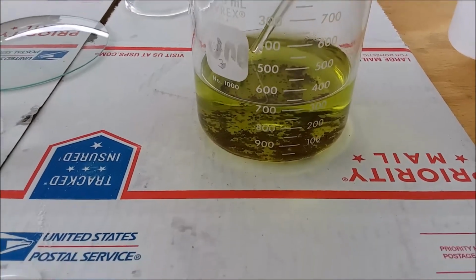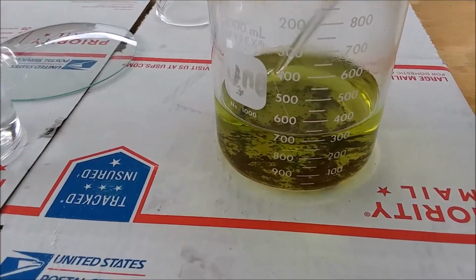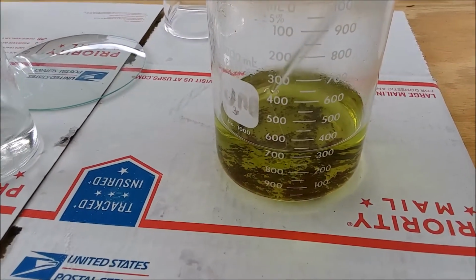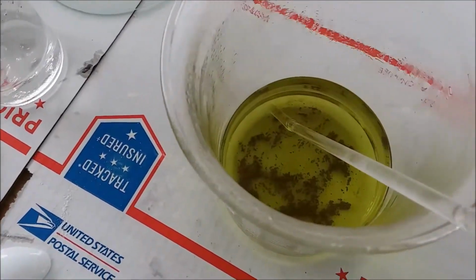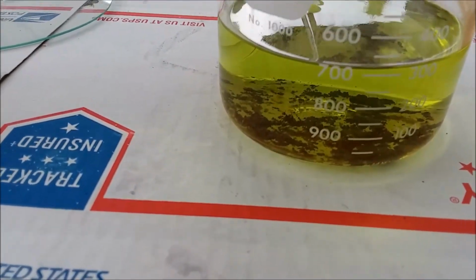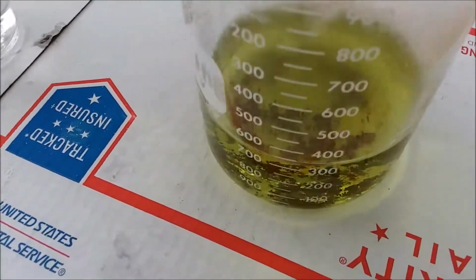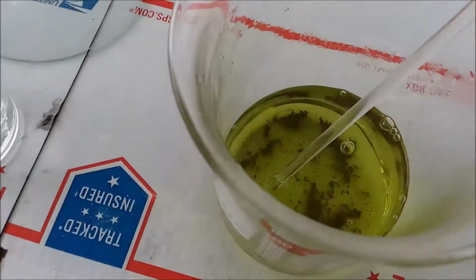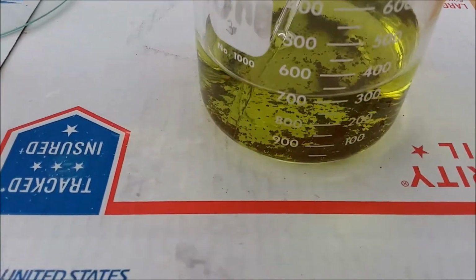Okay, I went inside just long enough to get the stuff to do the stannous chloride test. I was gone for maybe 30 seconds, just long enough for it to start raining and for the solution to clear up. I've never seen a gold drop happen that fast before. That's just insane. Normally I have to let it sit overnight for it to settle. And this is just almost instant. Big fluffy pieces of gold there, so that's good. Big fluffy gold powder that settles right back down once it's stirred up. So that's good. That's really good. Okay, so I did something right this time. I got to keep trying to do it right in the future.